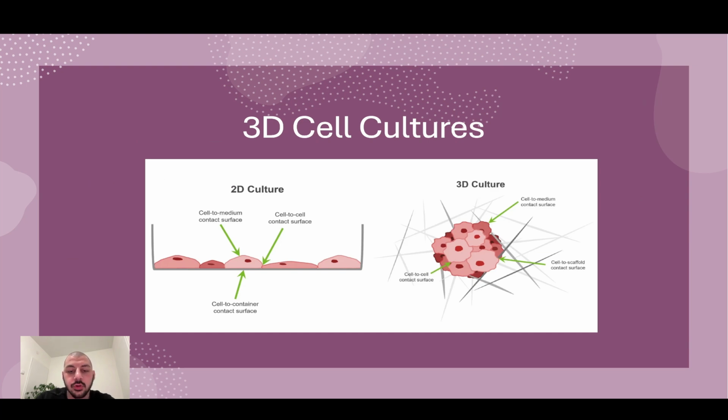Three-dimensional (3D) cell cultures are revolutionizing the way we study biology and medicine. Unlike conventional 2D cultures, 3D systems allow cells to grow in all three spatial dimensions, mimicking the structure and behavior of real tissues. This physiological relevance is critical for areas like tissue engineering, drug discovery, and cancer research, as it enables the development of more accurate models of human biology.